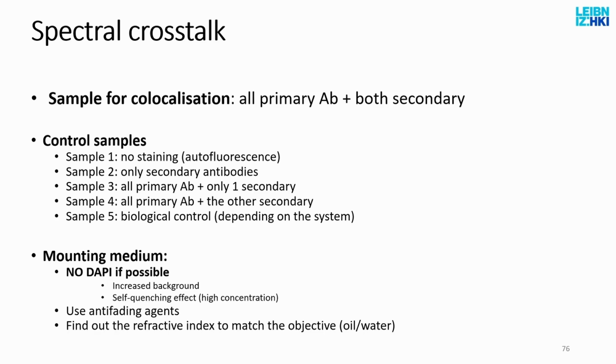But if I put water, then yes, I will add some error when I go from the objective lens to water to the cover slip. But this is a constant error. I can compensate for it. And then I go into water. So as I focus through the sample, let's say it's a 100 micron thick organoid, throughout these 100 micrometers I'm always in water, the same material that I have between the lens and the cover slip.